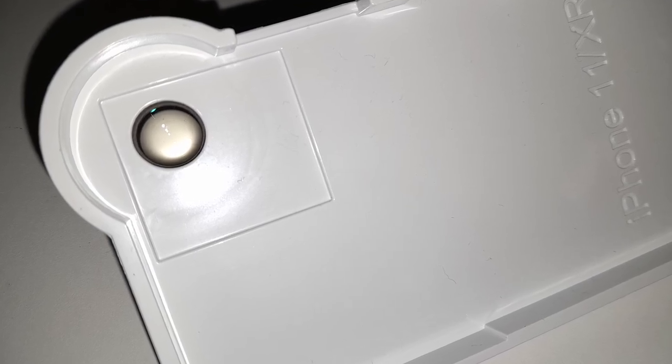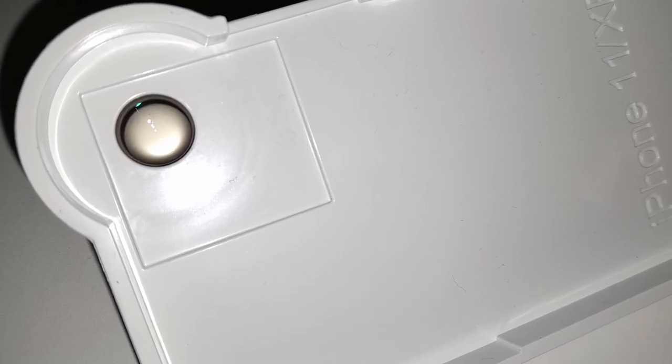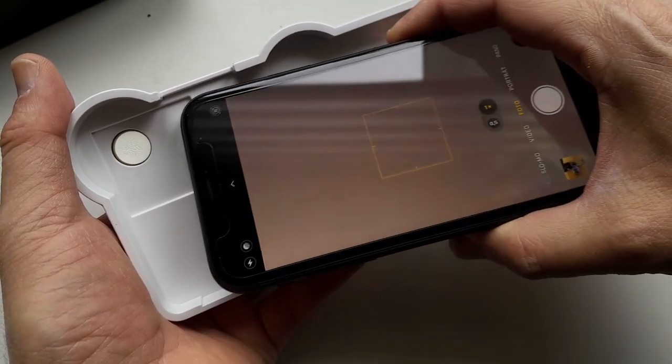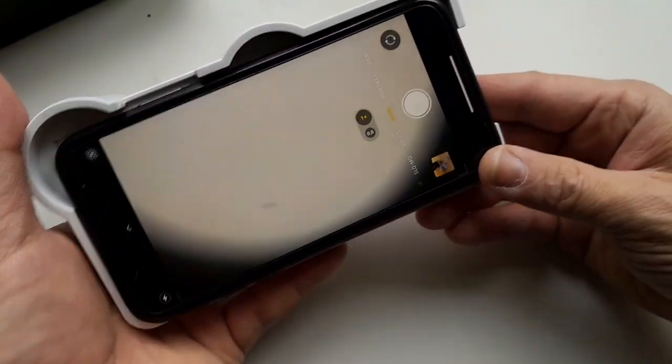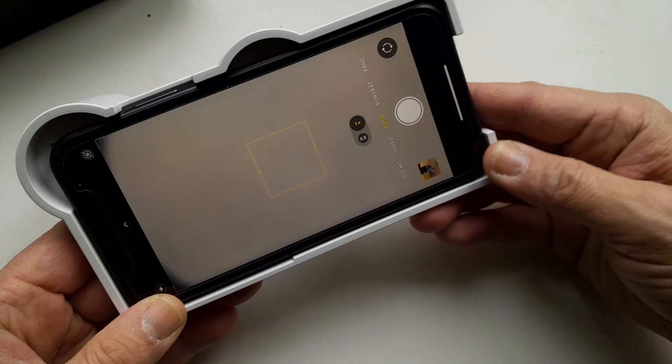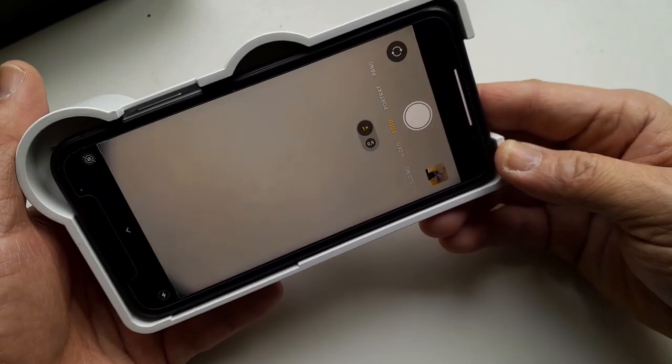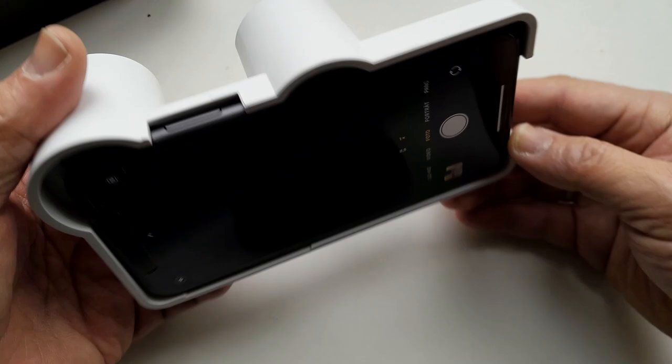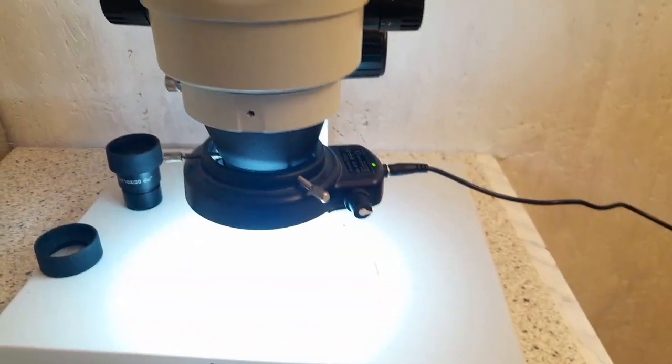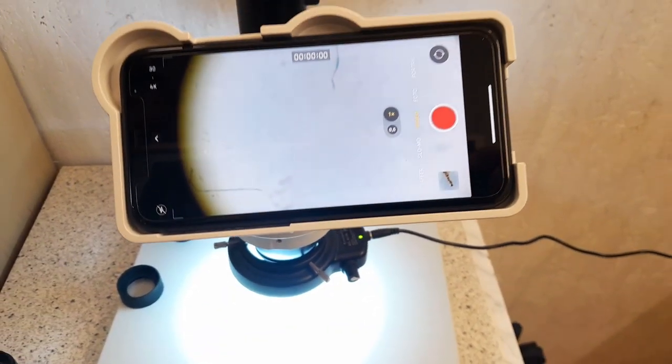And there's also no need to actually physically clamp the mobile phone into the adapter and everything is of course also pre-centered so there are no adjustments necessary. So let's put in the iPhone, the iPhone 11. As you can see here you just simply push it into the adapter and friction holds the mobile phone in place and there is absolutely no danger of it falling out.